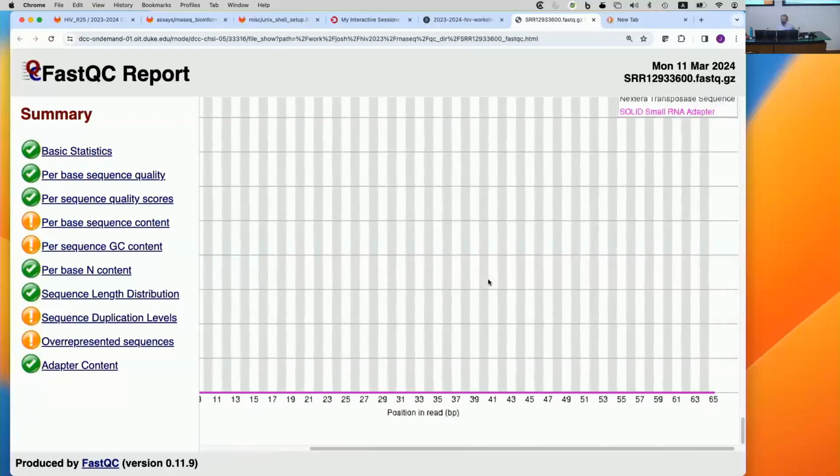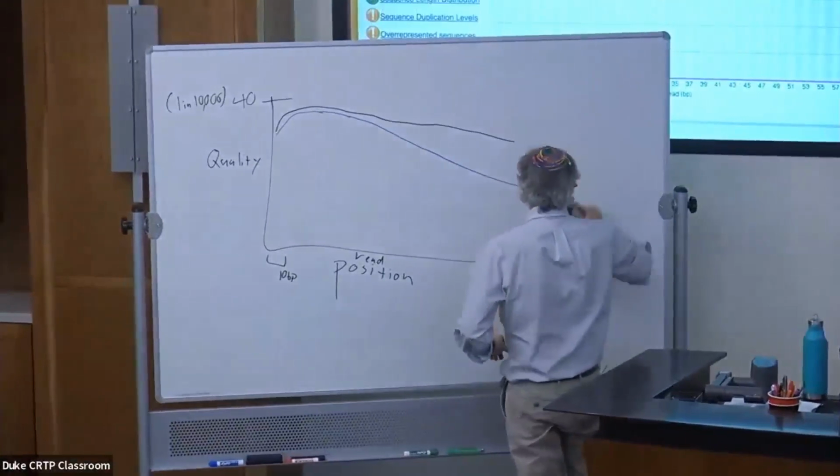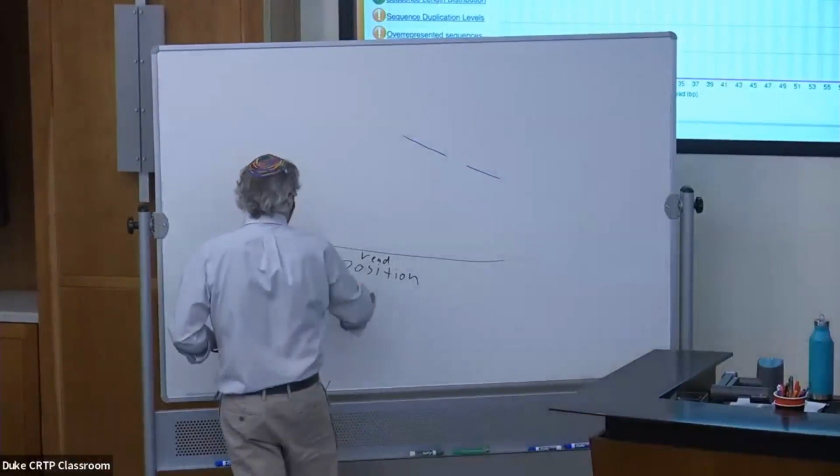Yep. Why would it be at every position when you see this adapter? No, it just depends on how big the fragment is, or how big the insert is.